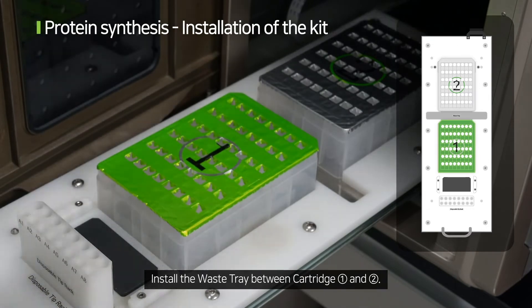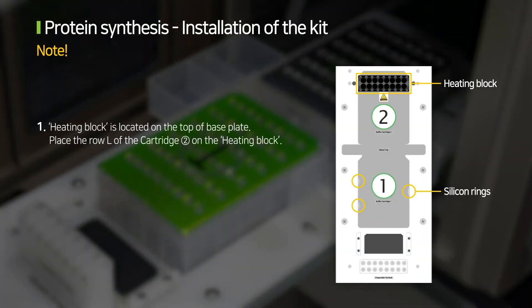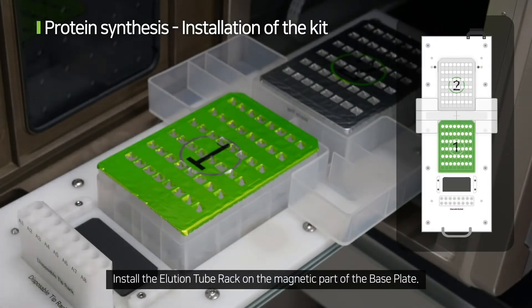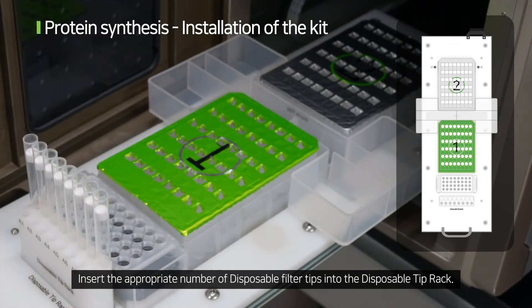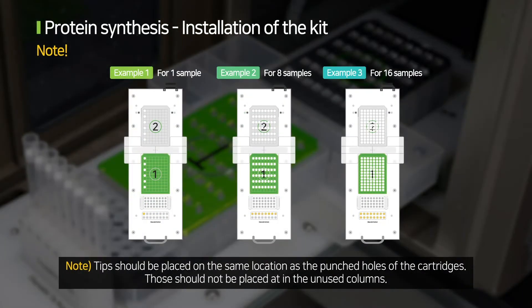Install the waste tray between cartridge 1 and 2. Note the following during the installation. Install the elution tube rack on the magnetic part of the base plate. Insert the appropriate number of disposal filter tips into the disposal tip rack. Tips should be placed on the same location as the punch holes of the cartridges and should not be placed in the unused columns.